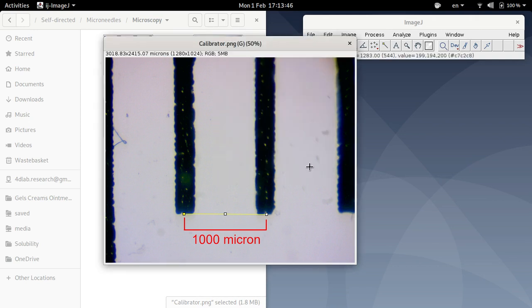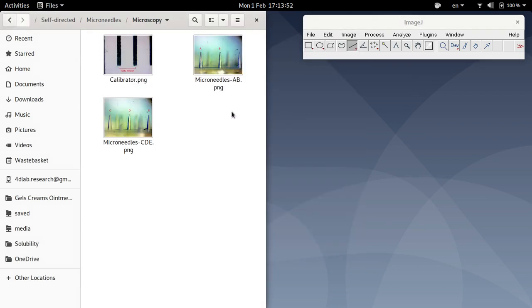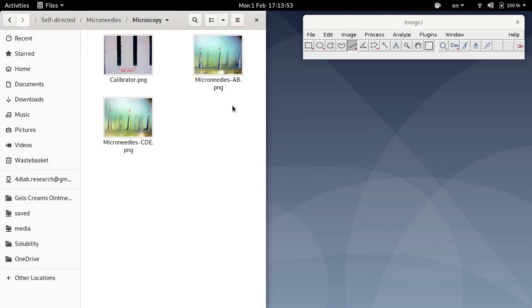Click OK. So the scale has now been set. So ImageJ is now calibrated for our measurements.